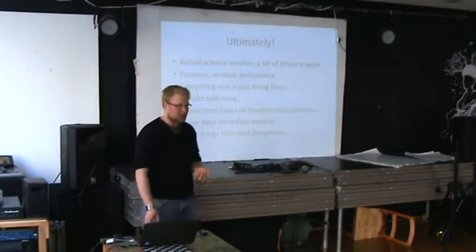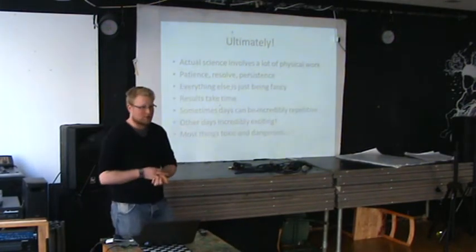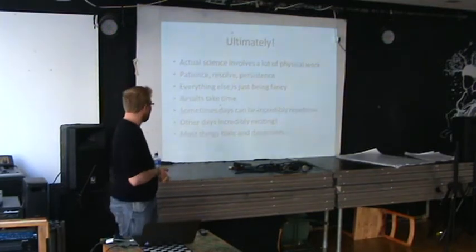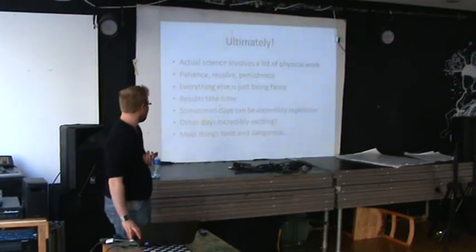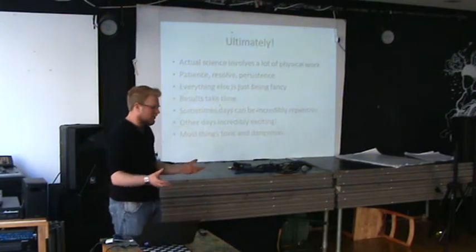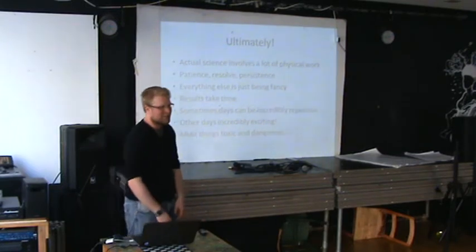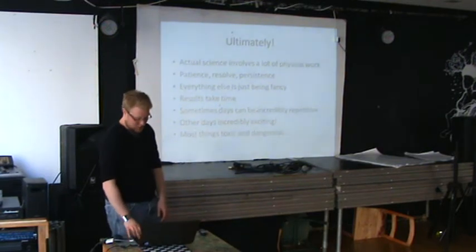And everything I showed you, from the gel, which is neurotoxic, to the methanol I use in my buffers, which is also neurotoxic, and the gel is also cancerous. Everything I work with needs gloves and massive precaution. Obviously, immortal cell lines aren't the best to be letting out in general. I don't want to let prion proteins out, so there's loads of waste that I have to bleach and things like that, and then you get bleach all over your pants, so I never wear any nice clothes. So yeah, everything is really toxic and dangerous in the lab too.